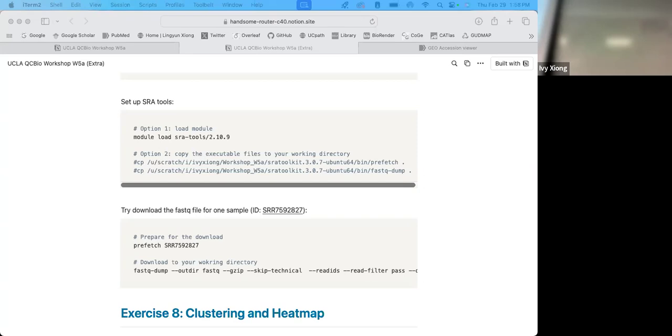Okay, so the replacement here. Run the next line, but it says that it's configured. Okay. You didn't make the directory that you wanted to. Oh, so the problem here is on your code. If you press up, there you go, go back. Okay, let's register this again.